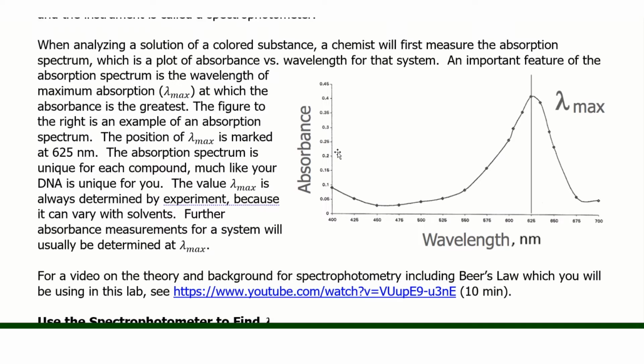Here we see an absorption curve. This is an important feature of the results that you gather from your spectroscopy experiments.